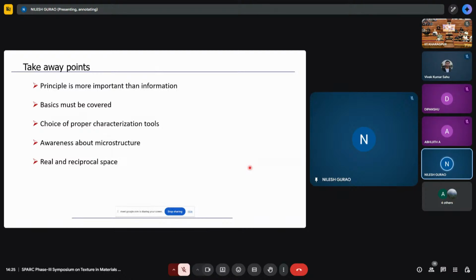Nilesh? So please tell me what are the different kinds of images that we can get in a scanning electron microscope? Okay. Have you heard about secondary electron image and backscatter electron image? Actually, Nilesh, can you hear me? People, are you there? We have to make it interactive, right? I am not going to blabber for the next 45 minutes. Yes, sir. Secondary electron and backscatter electron. So the spatial resolution of secondary electron image and backscatter electron image, which is better?